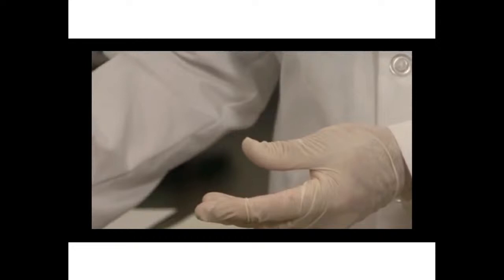Be careful not to press too hard to damage the IPG strip gel. The next step is to equilibrate the strips. I prepared buffers from the Ready Prep 2D starter kit as instructed in the manual. Remove the wet filter paper from the top of the IPG strip. Place the IPG strip into a lane gel side up of the rehydration tray.